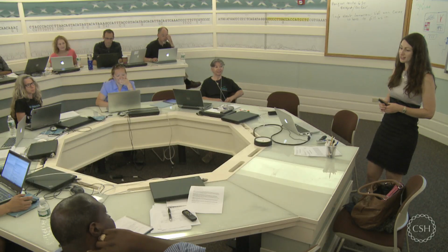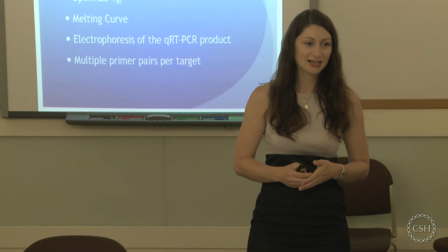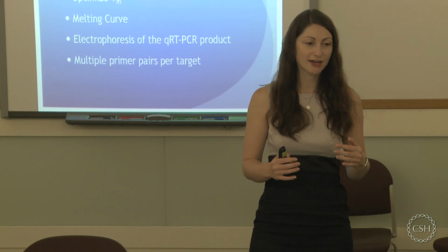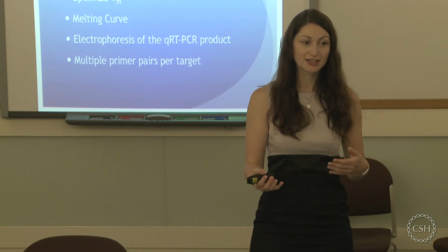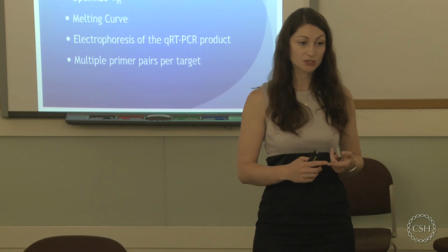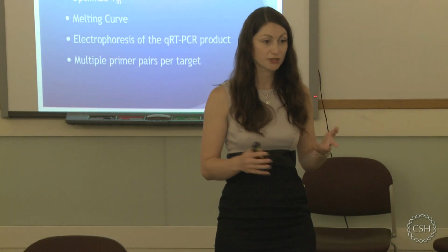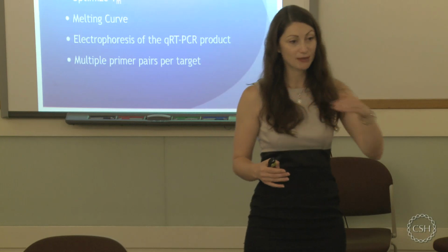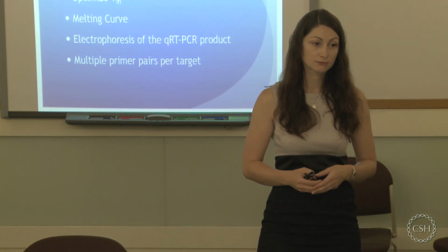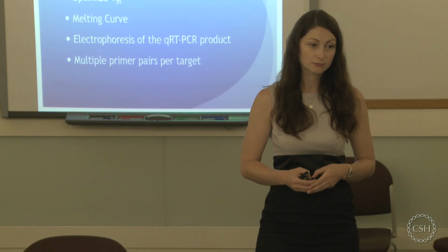Only in case, as we talked about, of sequence specific effects. If you're not sure if your primer is amplifying a pseudogene or a protein coding gene, something like that, then yes. Otherwise, if you know that your primers are specific and they can only amplify this one transcript, and you have the right band on your gel and your melt curve looks fine, I would not send it for sequencing. I don't think that's necessary in that case.